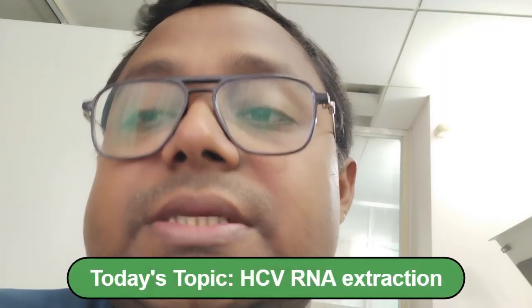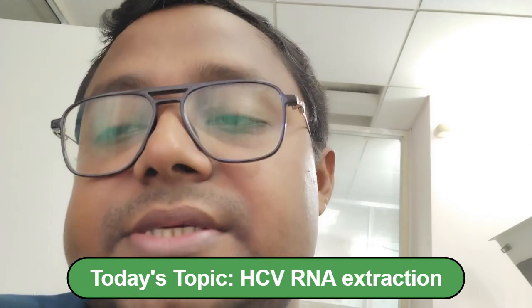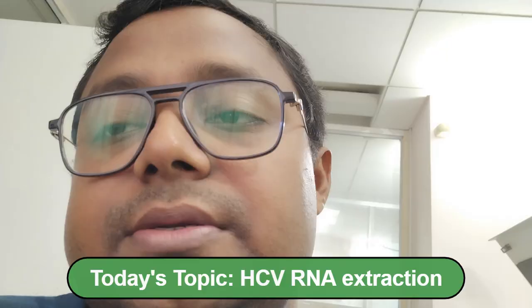I am trying to upload an interesting video on a new topic. Previously I uploaded a topic that deals with HCV RNA PCR. Today I am going to demonstrate how to extract HCV RNA, how to do RNA extraction.